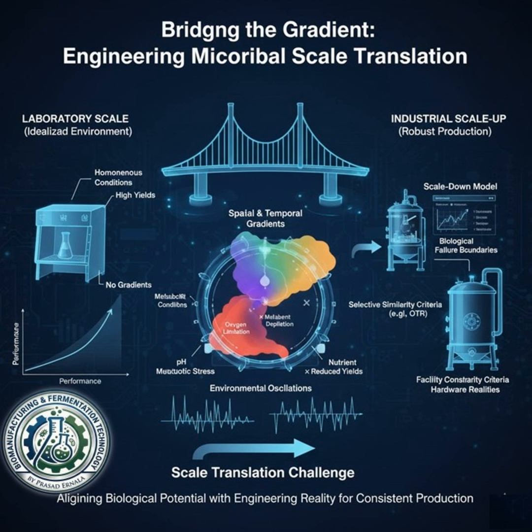Well, the sources are really clear on this. The pilot scale's main job is not performance. It's a risk exposure platform. A risk exposure platform. Its job is to show you the mismatch between your perfect, homogeneous lab assumptions and the messy reality of manufacturing, with all its mixing limits and sensor lags. So if you run a pilot and it's too clean, you've actually learned nothing. You've gained false confidence. You haven't stressed the system enough to find out where it's going to break at full scale. Let's get into the physics of why that happens.